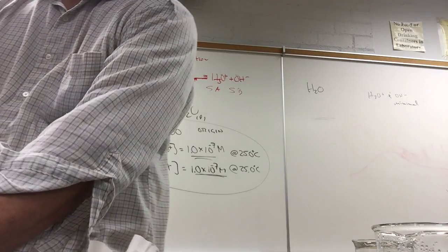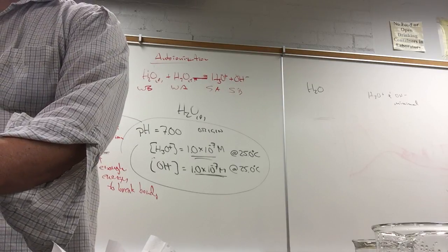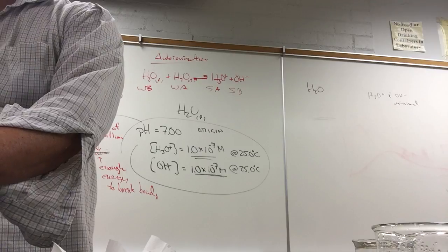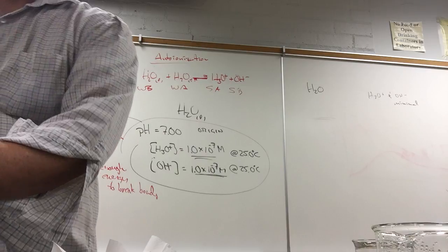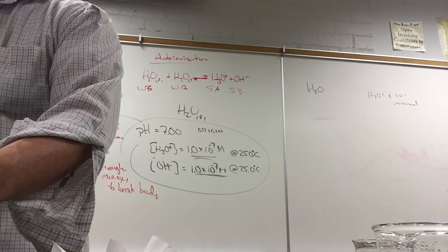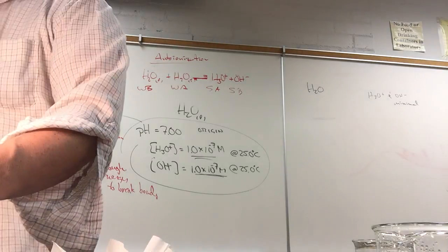It melts at a very high temperature. So how can I get some mobility in there? I can free up the ions. This is what we did with sulfate, remember? Sulfate was locked in an ionic lattice, and we freed it up by doing what? You'll tell me about it in the report. Just add some water to this.